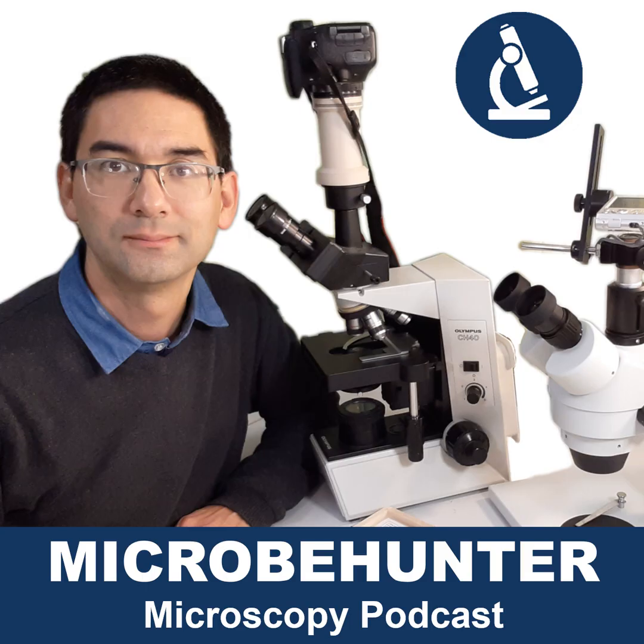And number two, the second reason why you won't need it is because biotechnology, molecular biology, and all of those biosciences nowadays are really not based so much on observation through a microscope. I tell you, most likely you're going to be analyzing biochemical pathways. You'll do genetic engineering probably to optimize some aspect in yeast or E. coli. Maybe you'll be designing or improving a reaction fermenter to increase the alcohol production of a certain yeast strain that you're using, whatever. But often it's like this, that microscopes are not that commonly used.